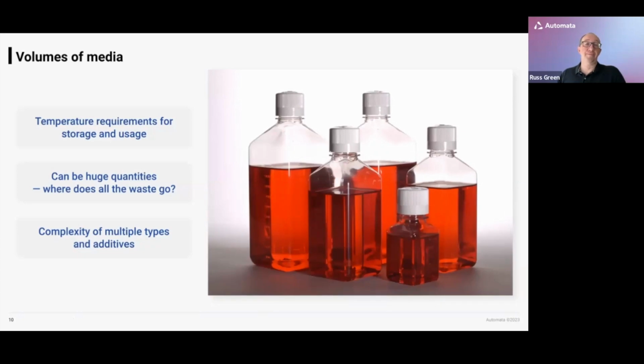Next, I want to touch on media. Media is a really interesting one, and often overlooked when building out solutions for tissue culture. If you think about what we do in a manual lab when it comes to media handling, and again, so many of these things, like the motions we made, we do subconsciously. We get so used to doing them, but we'll go to the fridge some period of time before we actually want to use that media. We'll get the media out and put it into our tissue culture hood. The reason we do that is so that it can warm up to room temperature, so that it's ready to use and we don't shock our cells. So we have to think about that when we're building automated systems.